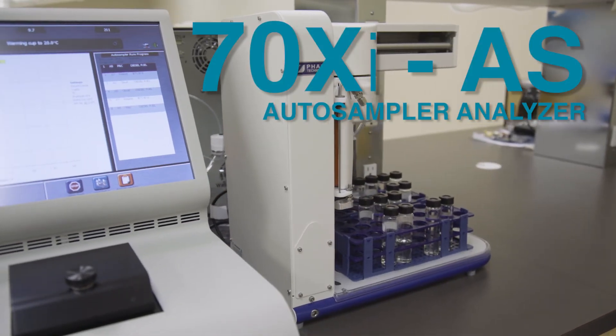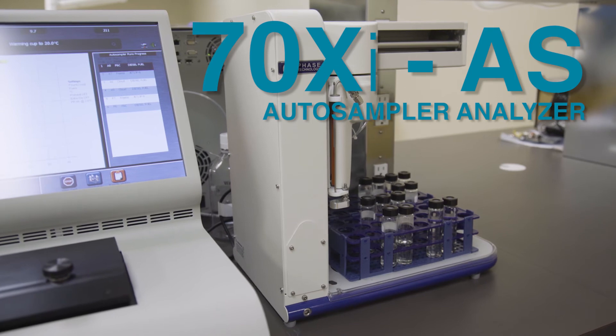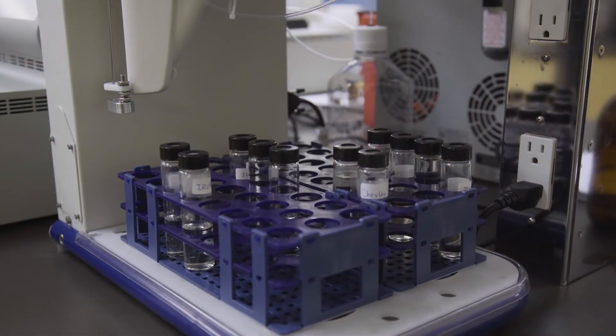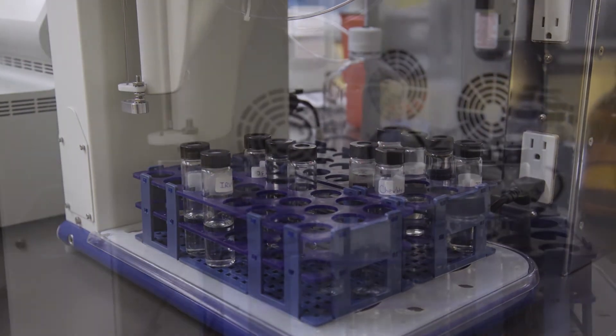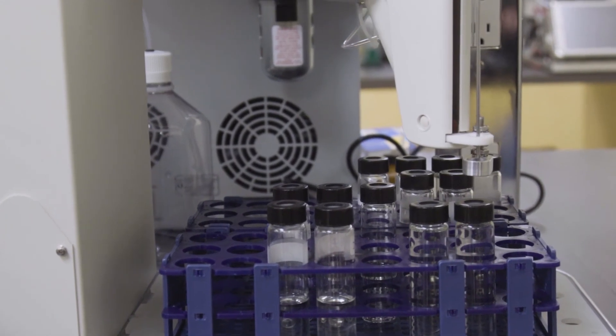The 70 XI Auto Sampler Analyzer is a complete system featuring automatic sample loading with a 48 position auto sampler and solvent-free automatic cleaning.